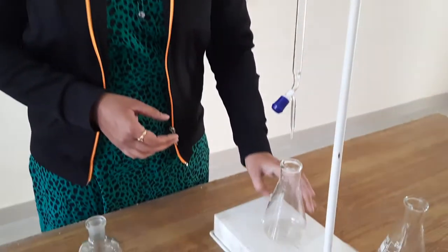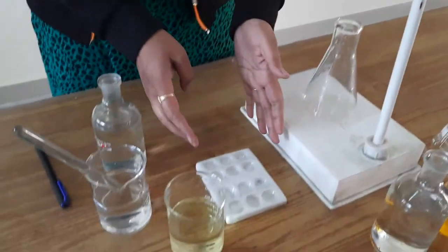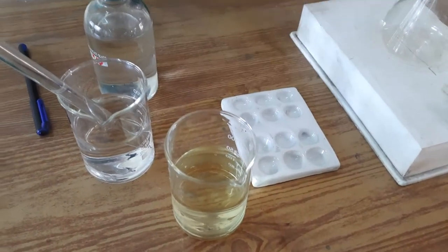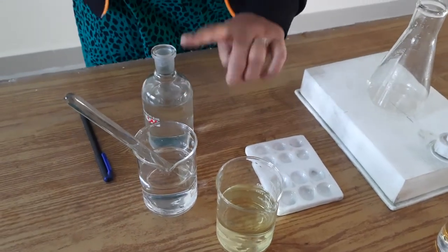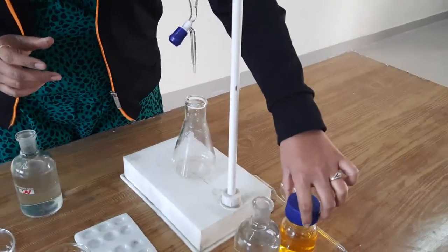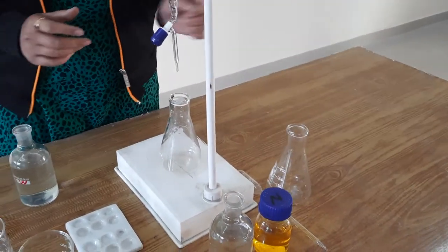As you can see, this is the burette, this is the burette holder, funnel and conical flask, pipette, and we have this porcelain disc for the external indicator. This is the external indicator, this is simply water, this is the ferrous ammonium sulfate, and this is your potassium dichromate solution — this one is colored.